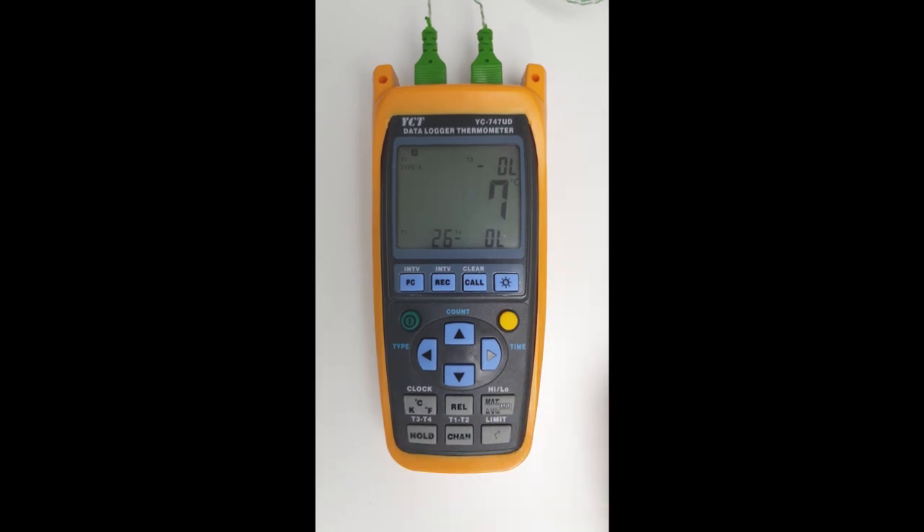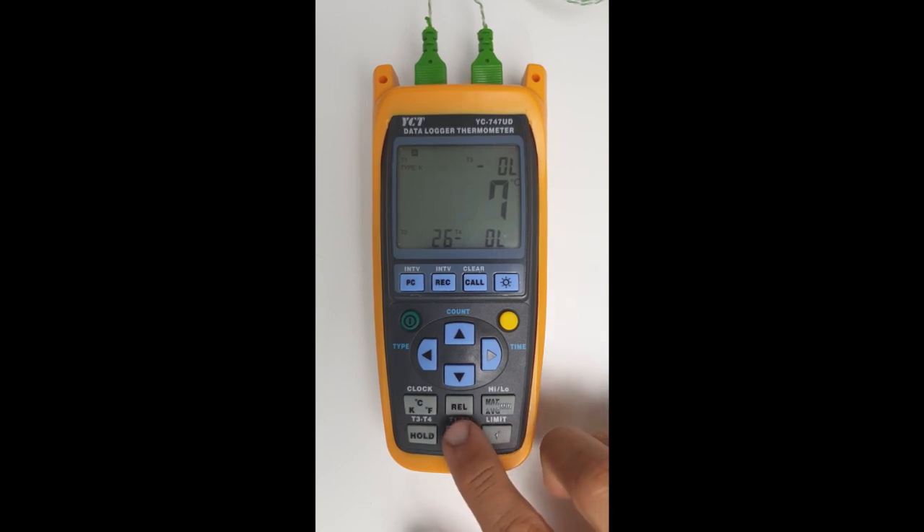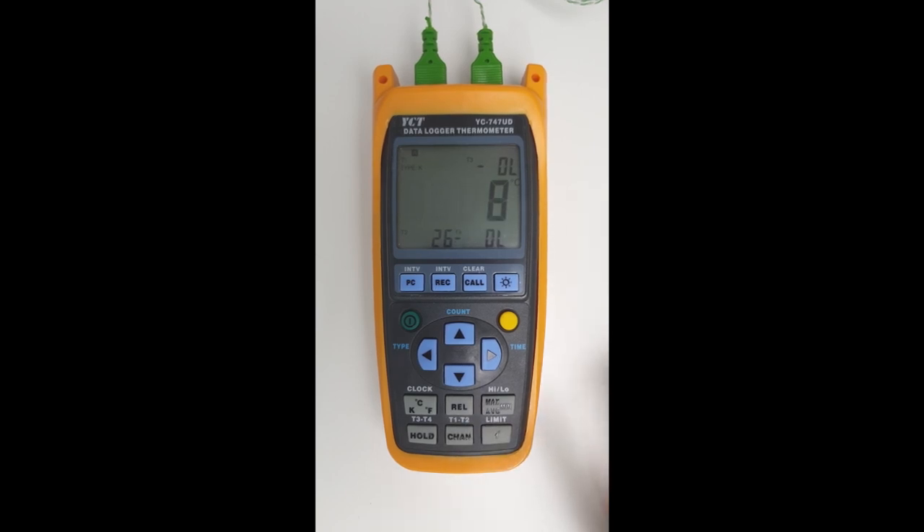The next feature we'll show is the actual large display and the channel in view. At the moment we have channel one in the main display, but we can cycle through by clicking on the channel button. Clicking shows channel two measuring. Clicking again shows channel three — nothing's connected so it's open circuit. Nothing's connected to channel four either, so it's also open circuit. Clicking again brings us back to channel one.